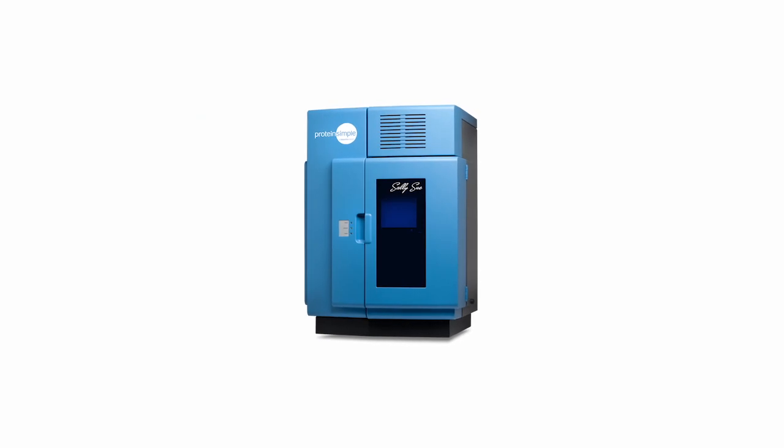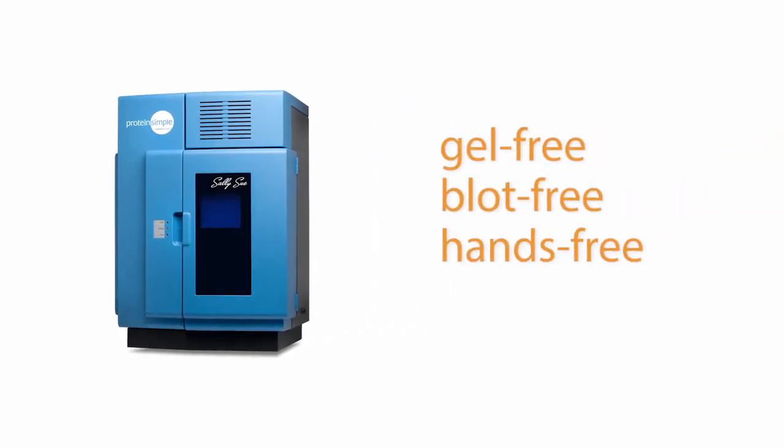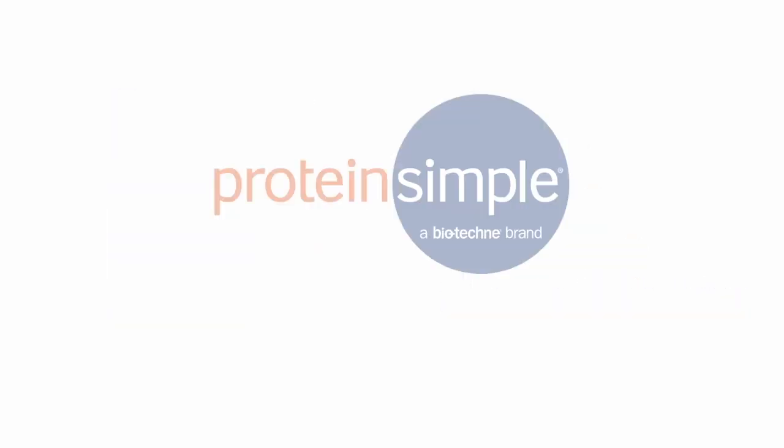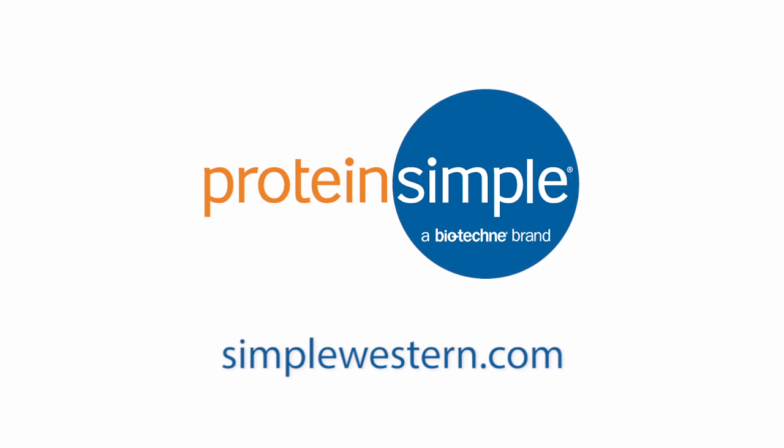All from Sally Sue. Learn more about the gel-free, blot-free, hands-free Simple Western by Protein Simple, a Biotechni brand, at SimpleWestern.com.